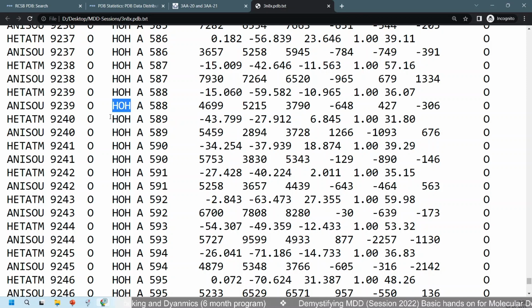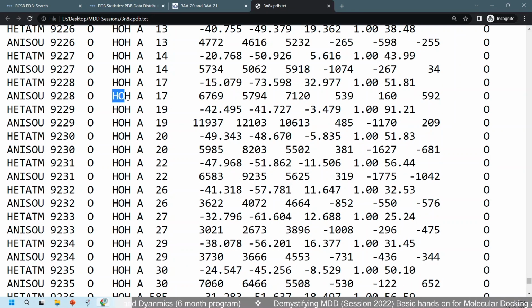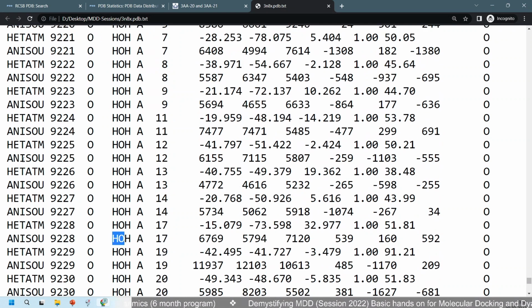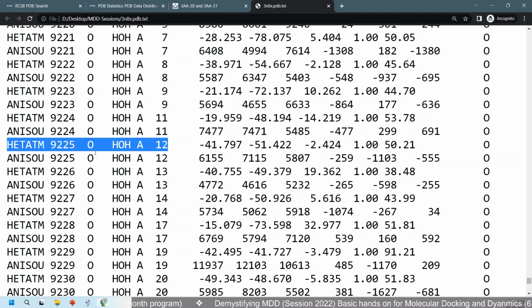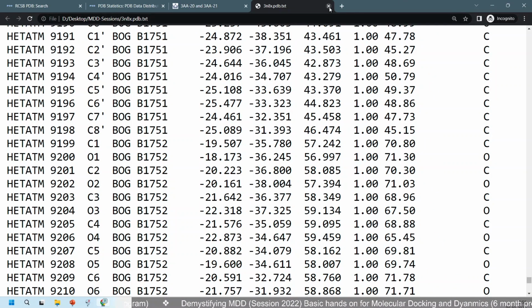So a residue means a collection of atoms. So this is also given some residue name. Here it is for a water molecule. So a water molecule should have a minimum of 3 to 4 atoms in its record. If we see clearly, it is showing that oxygen is there, and it's for number 12, means its hydrogen is currently missing. It should have hydrogen as well at residue 12. So it is missing. This is the basic understanding. Now I will move on from here.